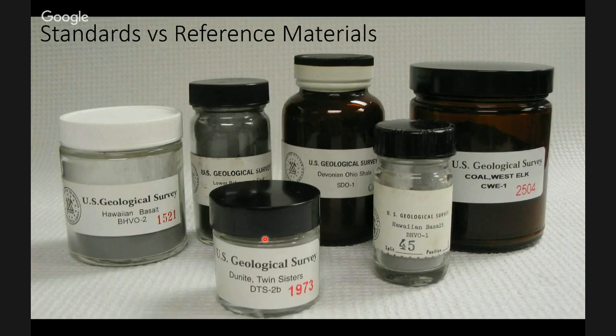When we're making our measurements, we'll have a set of standards, which will usually be a set of solutions of known concentrations, which we might have certified, or we might actually have made up ourselves by weighing out a known amount of iron metal or cadmium metal or some gravimetrically determined, internationally recognized standard kind of metal. But we might also want to use these things called reference materials.